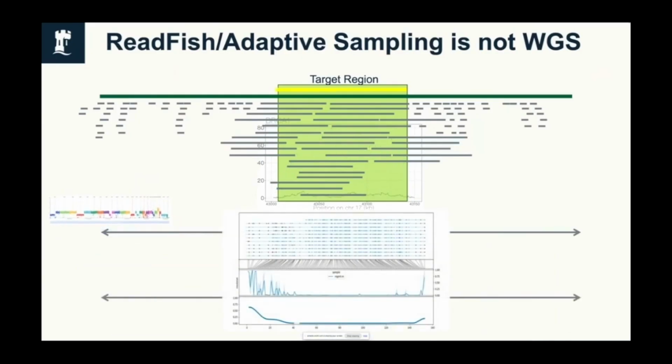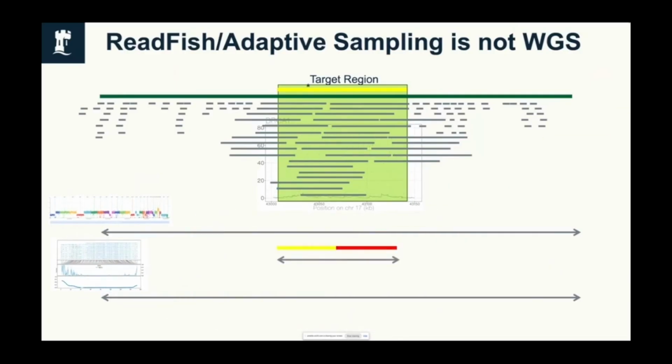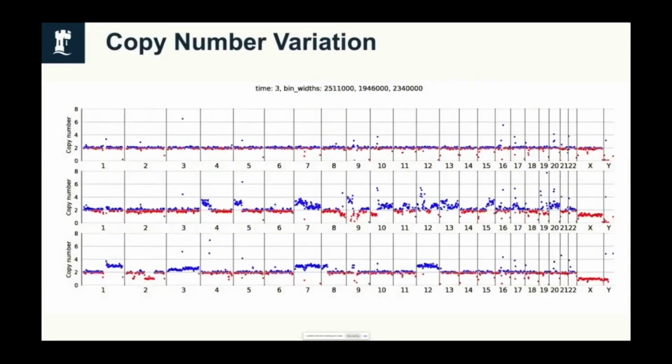Because Nanopore gives you multiple sources of data, you also get methylation. Here I'm illustrating methylation coverage over a specific promoter in the genome using methylartist to visualize that coverage. But you can look at methylation genome-wide in an adaptive sampling experiment by considering the totality of the data. You can also look for things like gene fusions, and you can look for point mutations if you have sufficient data. So we get multiple pieces of information from a single experiment. And critically, we get this information in real time.